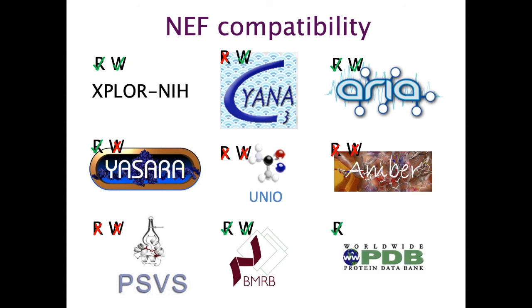And then finally, the databases, the BMRB and the PDB, are both accepting NEF files, and if something has been deposited as a NEF, then you can also write it, or as it were download it as a NEF file as well.